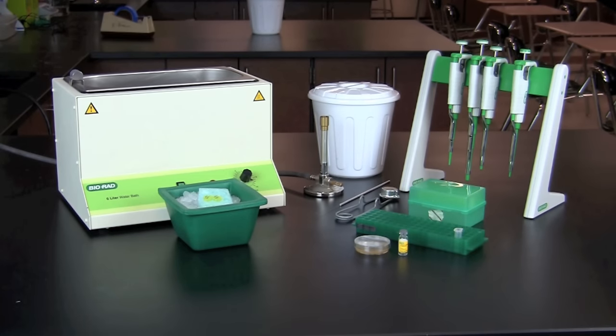In this video, you will learn how to perform a bacterial transformation. E. coli HB101 bacteria will be transformed with pGLO plasmid using a calcium chloride transformation.